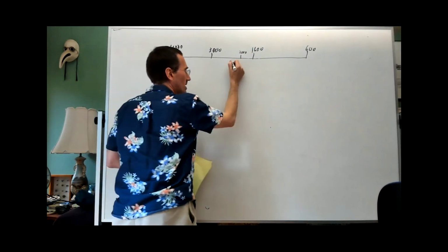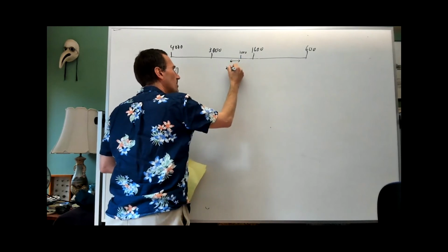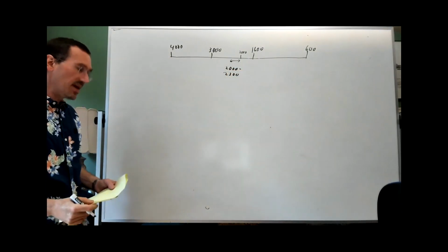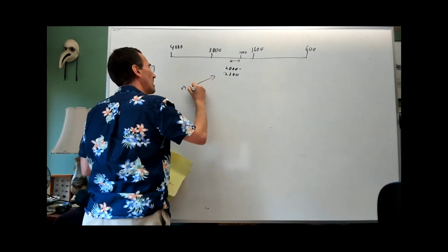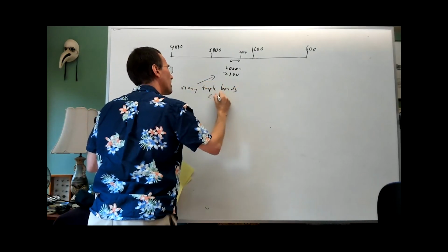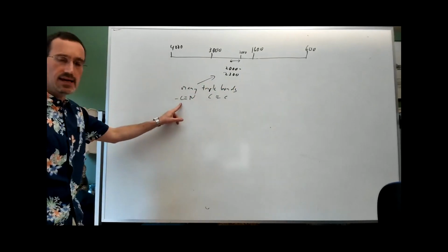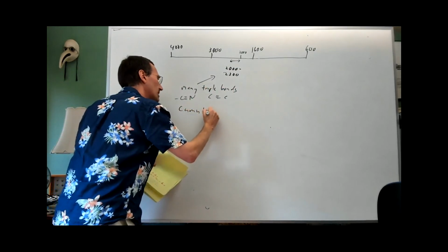So even if you don't necessarily know what it is per se, this region from about 2000 to about 2300 is really interesting because usually you're not going to see anything there with many compounds, except if you do, you're going to have many of your triple bonds. So we talked about acetylenes, we've talked about nitriles. If you're an inorganic or organometallic chemist, you'll see carbon monoxide there. But also you're going to have cumulated compounds.